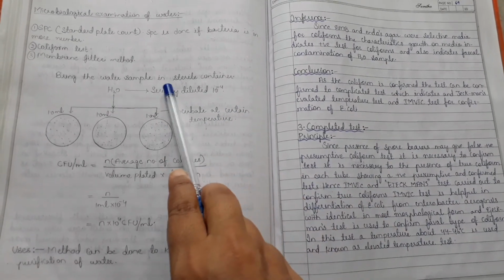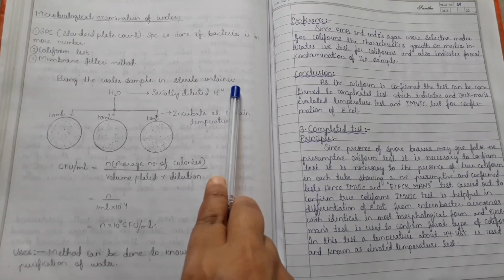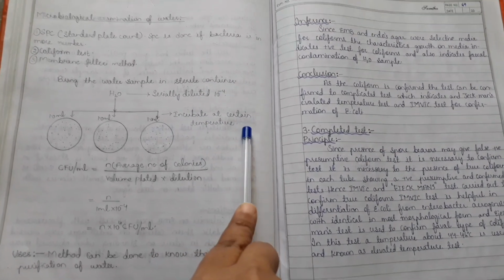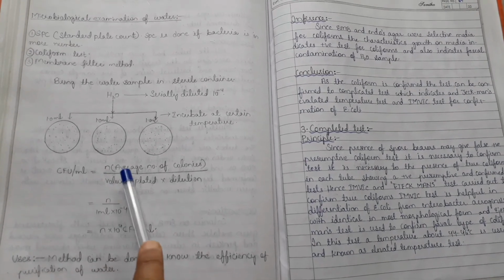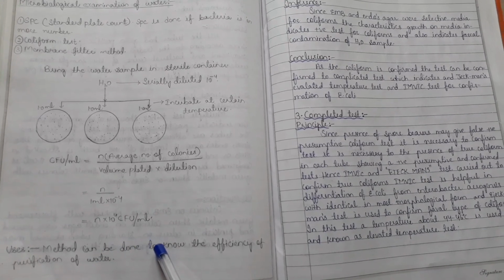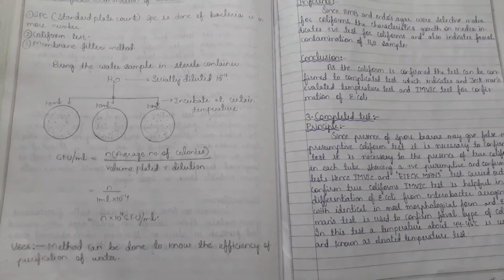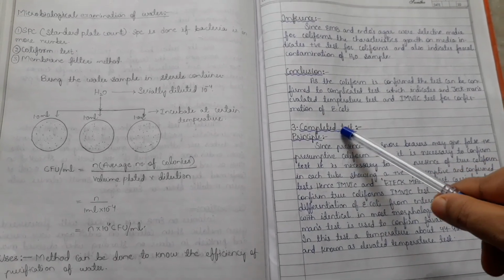Bring the water sample in a sterile container and serially dilute it up to 10 to the power of -4. Incubate at a certain temperature. Then CFU per ml is calculated; this is the formula. This method can be done to know the efficiency of purification of water. The third one is the completed test.